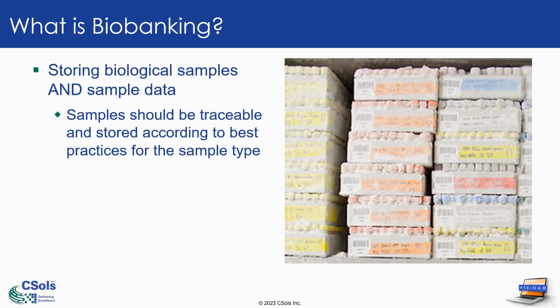I often like to compare biobanking to library science. With library science, you're like, well, you have a book on the shelf in the library, how hard can it get? But people get entire PhDs and have entire careers in the best practices for managing collections and for managing all that associated information and data. So while it kind of seems simple to start, samples in a freezer is a biobank, it gets a lot of hidden complications and concerns.